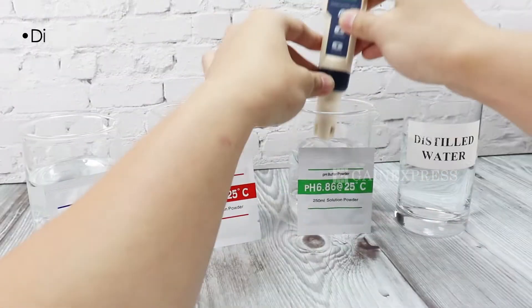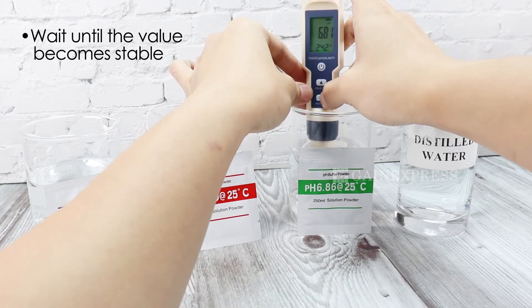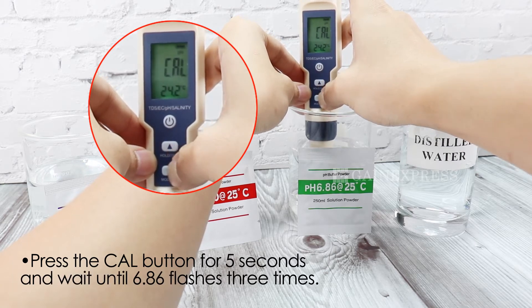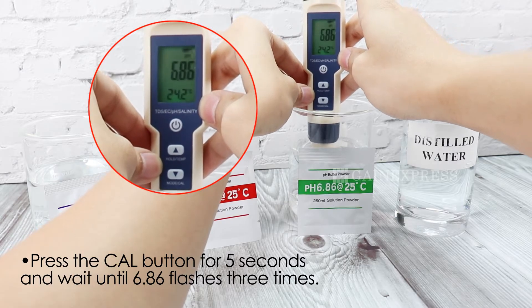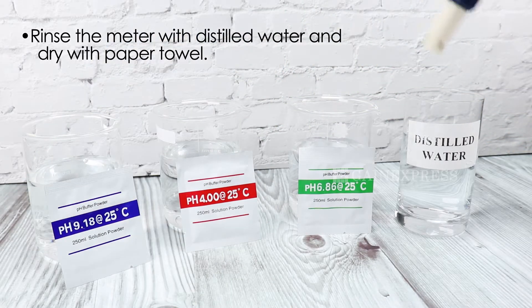Dip the rinsed electrode into the pH 6.86 solution. Wait until the value becomes stable. Press the CAL button for 5 seconds and wait until 6.86 flashes 3 times. Then clean the electrode with distilled water and dry it.